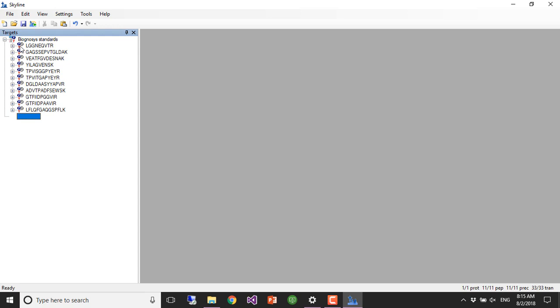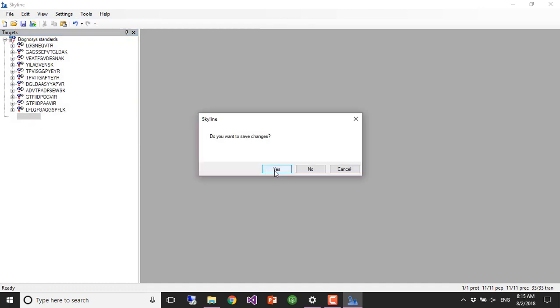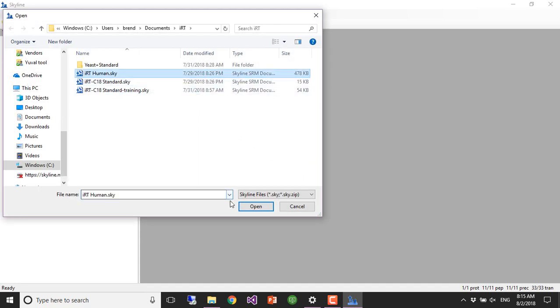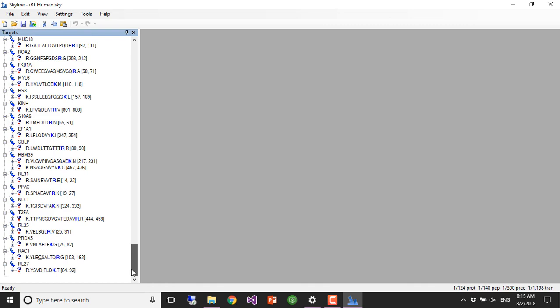All right. Well, let's actually start over because I realize that there's something else that we would like to do. So you can just forget about that for the moment. And we're going to open the file with the peptides we want to work with. Do you want to save changes? No. And let's open this iRT human. So this is our set of peptides which we've measured.